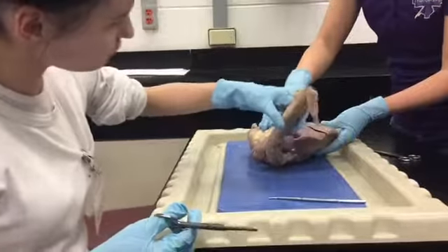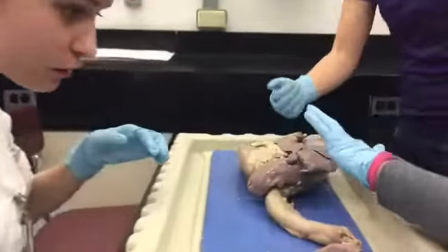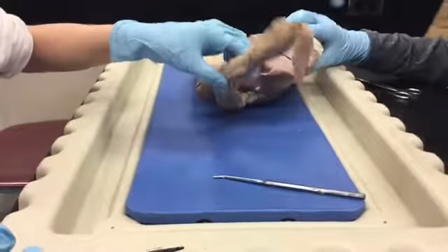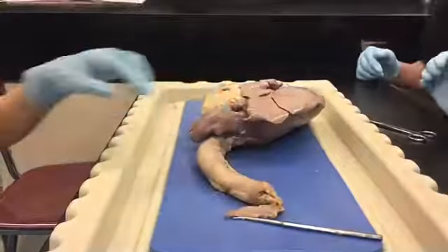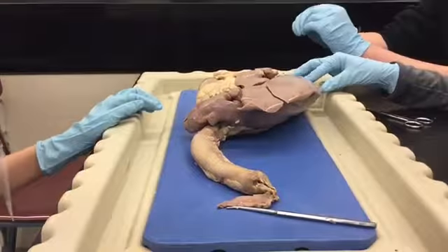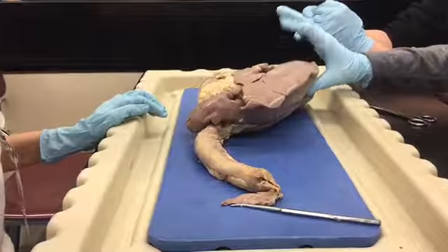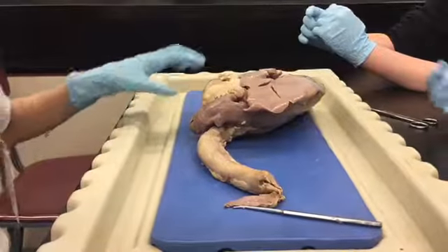Okay. Can you see the lungs? Esophagus. Get closer with the camera. One, two, three. Here's the esophagus. Look at all your diaphragm. Wow. Here, I think this one's our right lung. So excited about diaphragm.